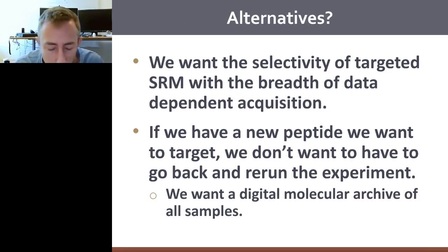Okay, so there's still a challenge here in that these assays take a lot of work. They take a lot of time and effort to set up. What would often happen is you'd run an assay measuring 100 peptides or 100 proteins in 1,000 different samples. And then you'd go, geez, there's this paper that came out, and it says this other protein, this other peptide, is actually really important in this sample set. So then you have to think about going back and remeasuring all those samples again.